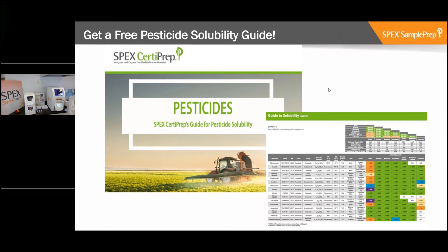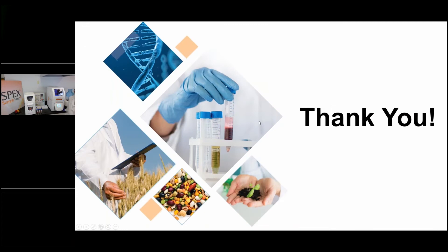Thanks very much, Patty. We're moving on now to the live demo. We have Eric in the lab. My name is Eric Smith, I'm the application scientist here at SPEX SamplePrep. Today we're going to do a quick demonstration of the QuEChERS method using the 2010 Geno Grinder. The method we're going to use is based on the AOAC method. The steps will include the agitation steps, the extraction steps, and the cleanup steps.